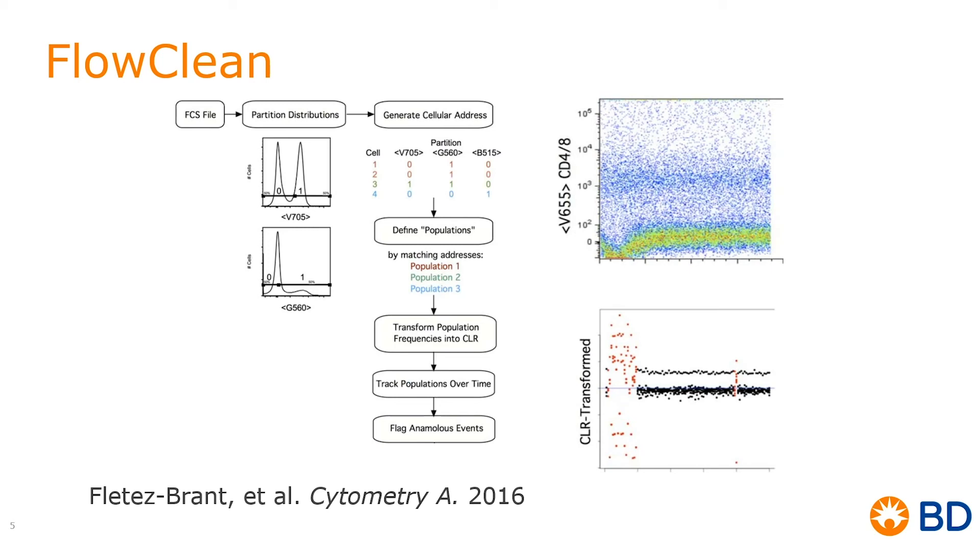Therefore, it concatenates them into one population, and those are then generating several populations based on your own sample. This is then transformed into CLR, and as we have a graphical representation of CLR on your right, we track these populations over time, and any that differ will then get flagged as an anomalous event. You will be given two outputs, FlowClean good data and FlowClean bad data. We will go through this with some real-time data analysis so you can see how this works.